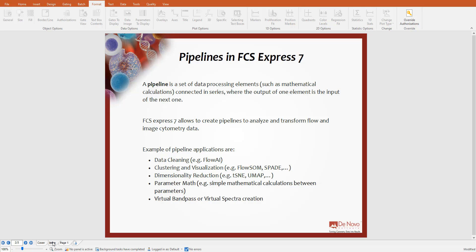Examples of pipeline applications are data cleaning, clustering and visualizations, dimension reduction, parameter math, virtual bandpass, or virtual spectral creation.